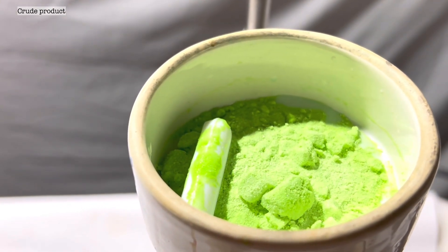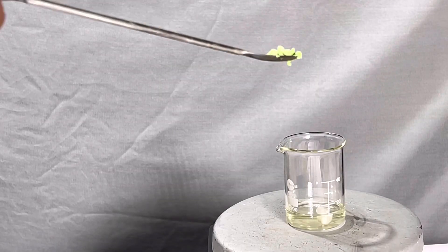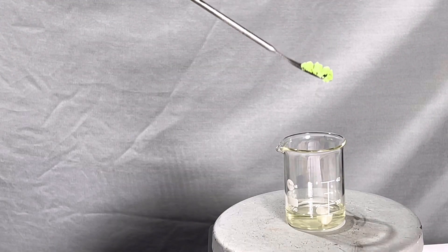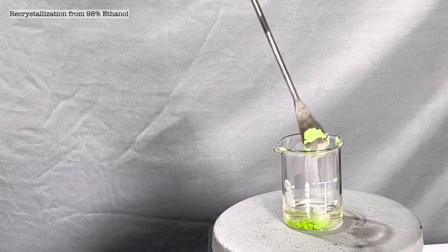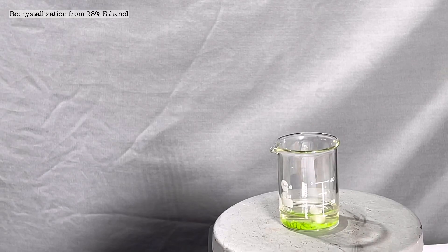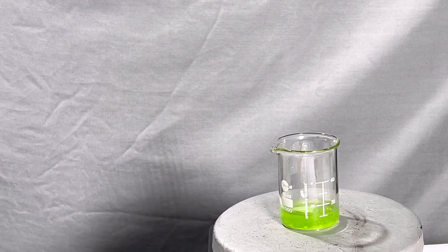To purify it we move on with recrystallization. Recrystallization is achieved from about 40 milliliters of 98% ethanol. The compound was added to the ethanol and was gently heated until everything dissolved, taking approximately 40 milliliters of ethanol for that.